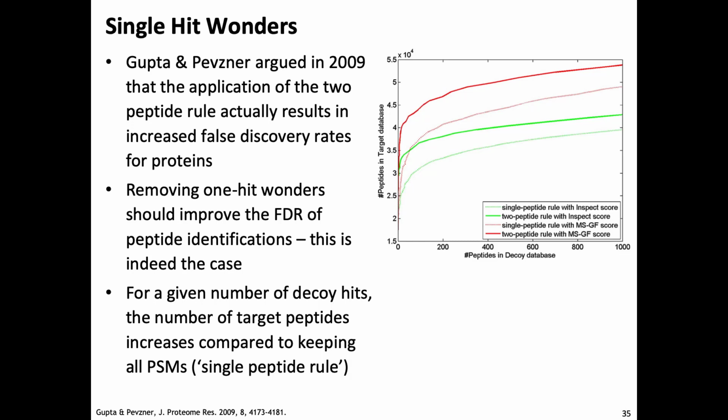So oftentimes you see in the literature people aggregating measurements from different fractions, aggregating across thousands of samples in order to find all the proteins, to increase the protein count. You remember the human proteome paper we were talking about earlier that was aggregated over a large data set. So what happens if you do that? Then you take the maximum over all these correct hits. The maximum is going to be very close to the distribution of the correct hits.